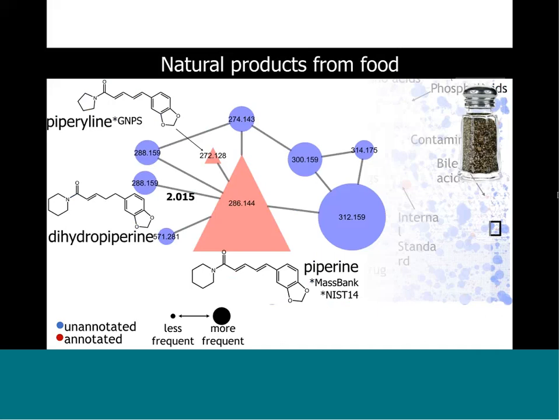And then adjacent to this we had a match that was 14 Dalton separated, and that was a match to a molecule that somebody from the GNPS community had contributed. And you can see the difference between these two annotated molecules is 14 Dalton, and that really resides from the part of the molecule on the left side where we have a 6-membered ring versus a 5-membered ring.